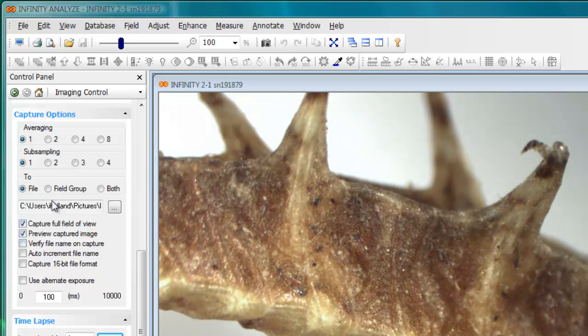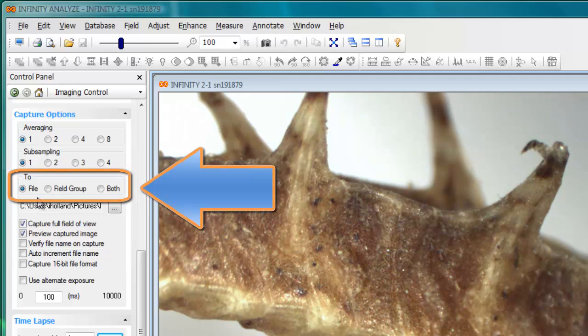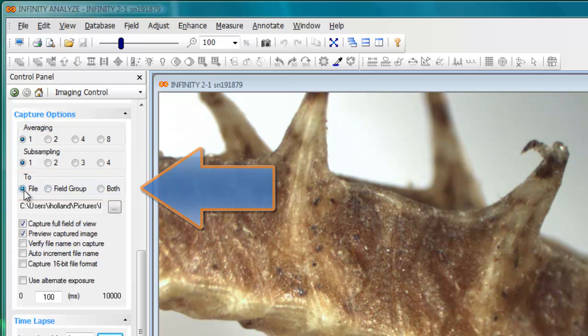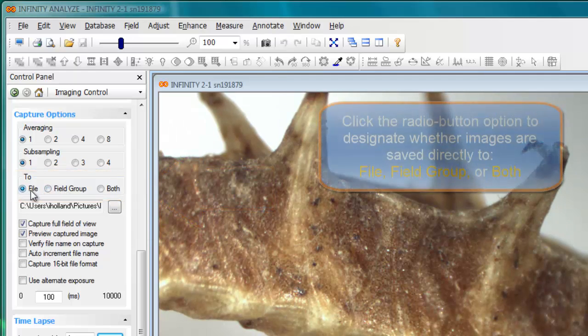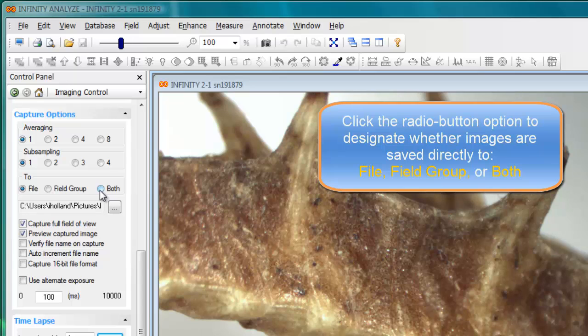Let's start by looking at where the files will go each time you click one of the options to capture or acquire an image. This box here specifies whether or not files are saved directly to disk as image files, whether or not those images go into the field group, or whether they go to both simultaneously.